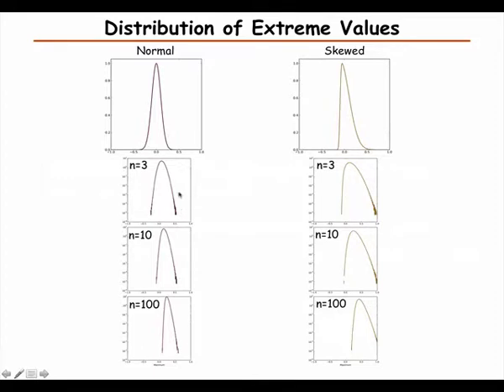So what we see here then is that the tail is an exponential. It can be pretty well approximated with a linear function when we plot it on a log scale. And so what happens then if we randomly pick 10 values from this distribution and take the maximum of that? We again have more of a shift towards higher values, but still an exponential tail. And then here in this case, 100, we again get a larger shift, but again exponential.